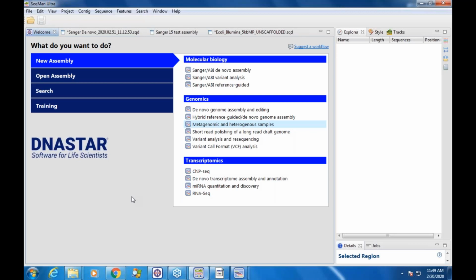Great, and we have a final question that just came in, which is a user saying that after they are notified that their assembly has completed successfully, they click on the Open Assembly Results button at the end of the Engine Wizard. But the results are going into separate files. Each one is comparing the reference sequence to one sample. And she was expecting it to compare it to all of the samples. Is that an issue with the multiple project or multiple projects?